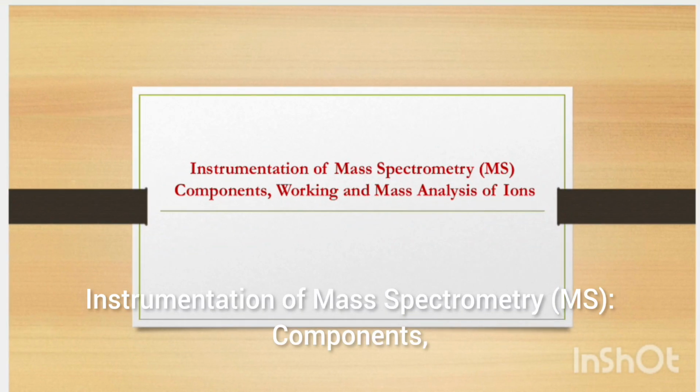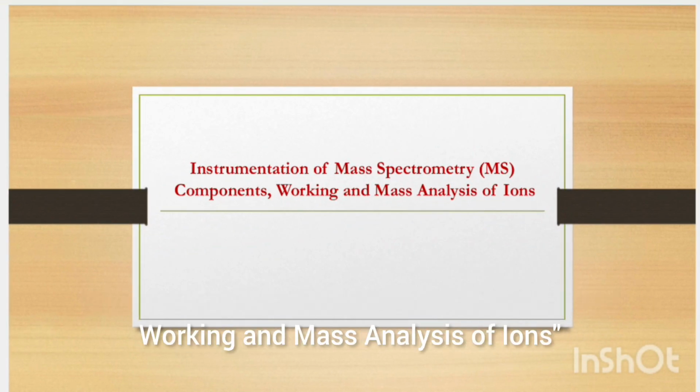Instrumentation of mass spectrometry, components, working and mass analysis of ions.